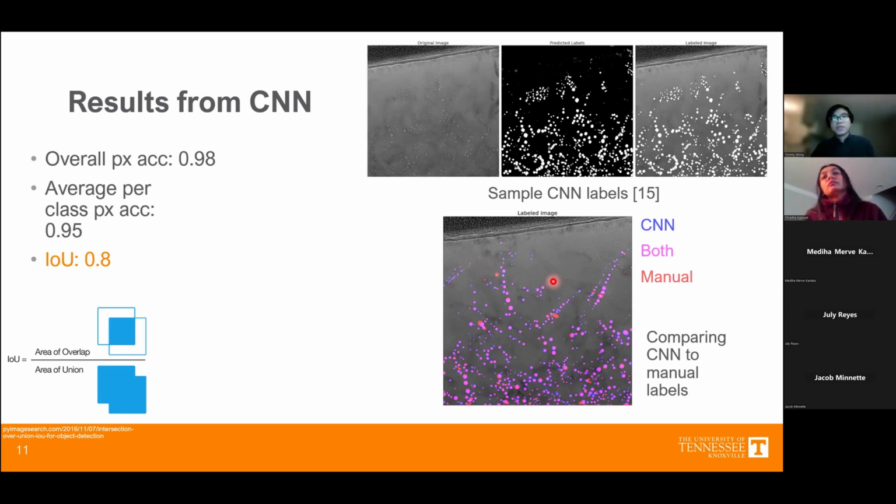Right. So the first step would be to actually label them properly. For this data set, because we assume the bubbles are spherical, we just use the circle tool on ImageJ. Some of them might not actually be as spherical. So labeling the data properly is the first step, and then to actually better extract that boundary, that would come from the post-processing step.